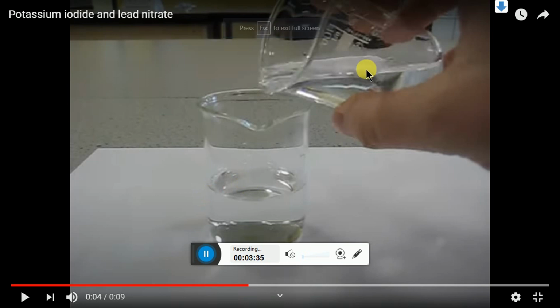Now this is the lead acetate solution. This is your potassium iodide. In this case, we take lead nitrate solution. You can imagine in your book that this is the lead acetate solution as well. This is the potassium iodide solution. These two are clear solutions. We don't have a test tube, so prepare this in the beaker.